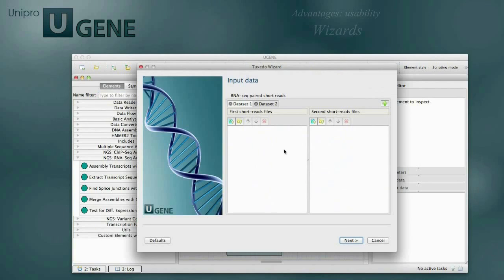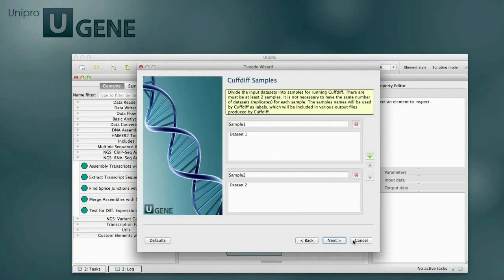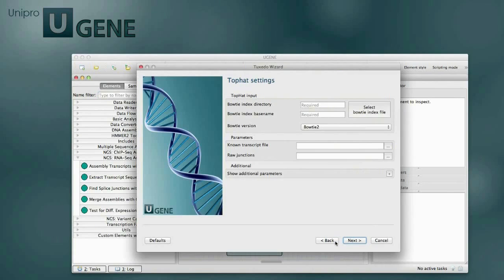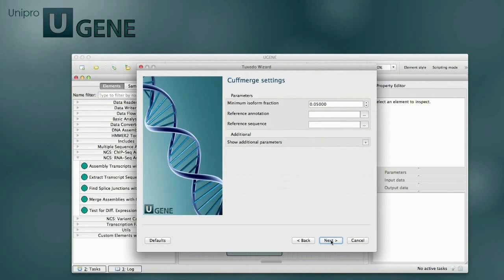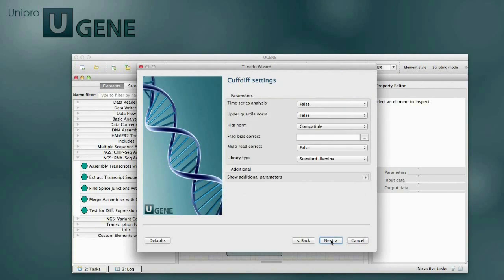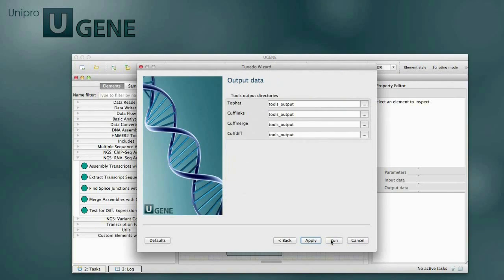Each NGS workflow is equipped with a wizard. The wizard is a simplified way of setting the workflow parameters and input data. The wizard is logically divided into pages, and each page has its own set of settings. Going through the wizard, you set the workflow parameters step-by-step.